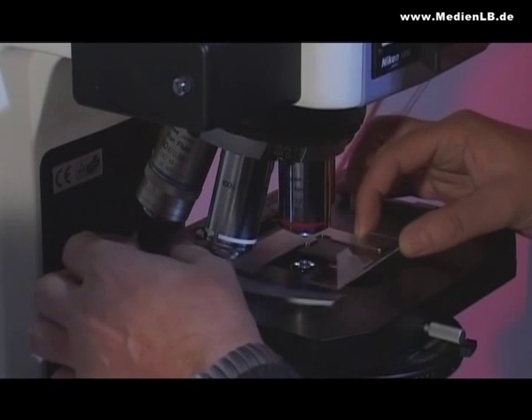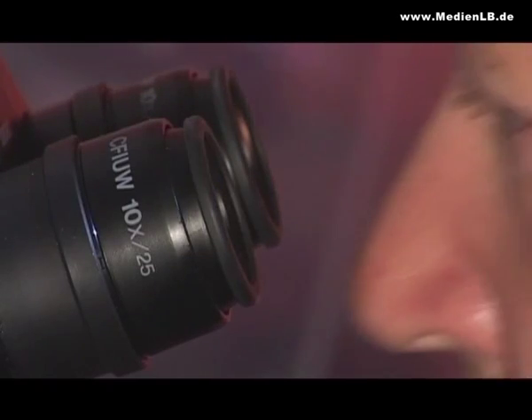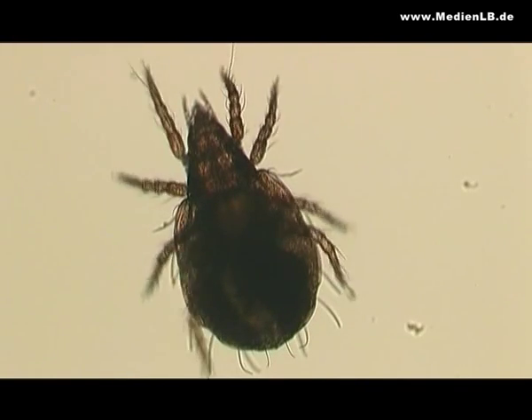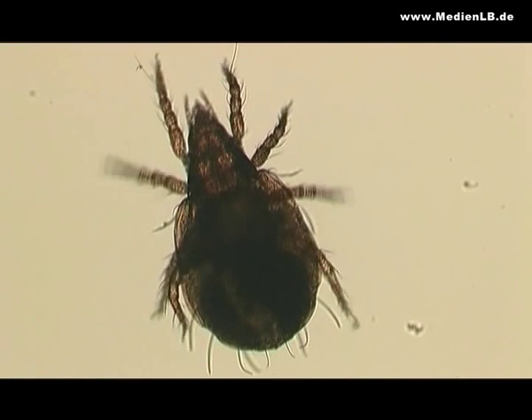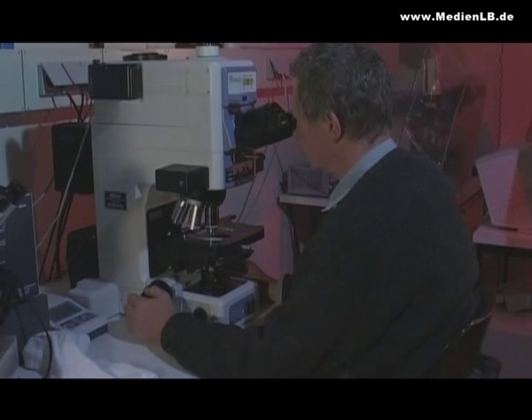If the magnifying glass is not strong enough for a closer look, we need an optical microscope. Just as with the magnifying glass, the light rays reflected from the specimen below fall onto a convex lens. This produces a magnified, reversed, real image on the second convex lens, the ocular.